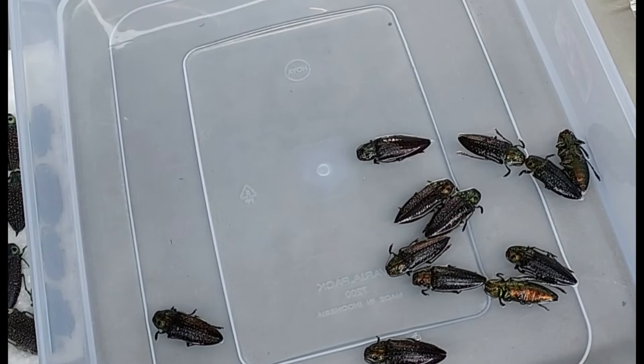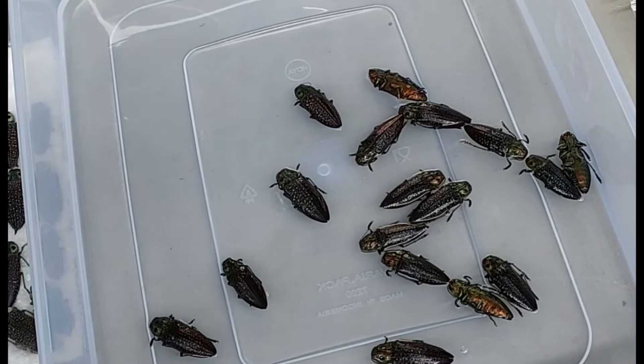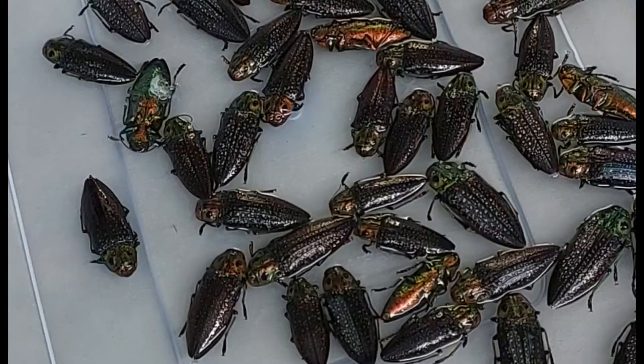Lastly, put on the lid and let the beetles soak overnight. After then, they'll be relaxed and ready for pinning.